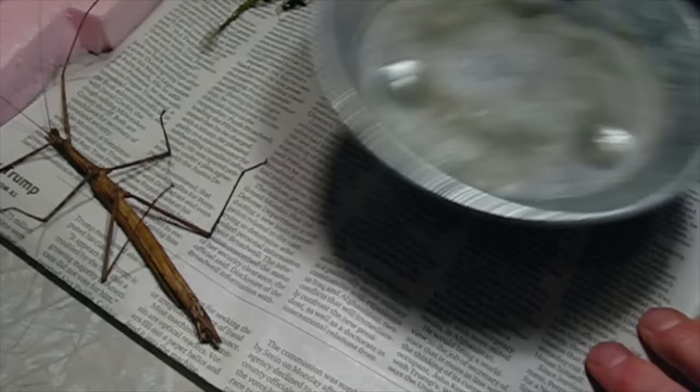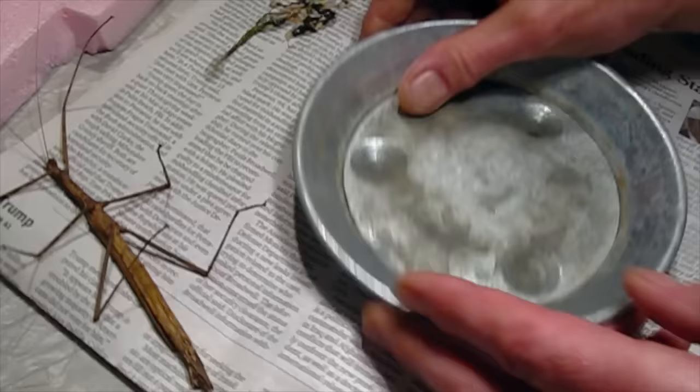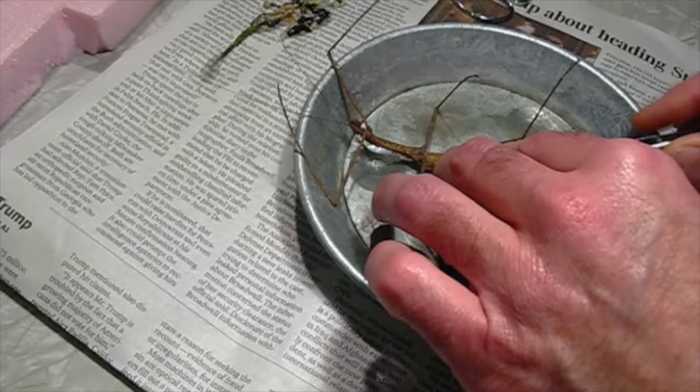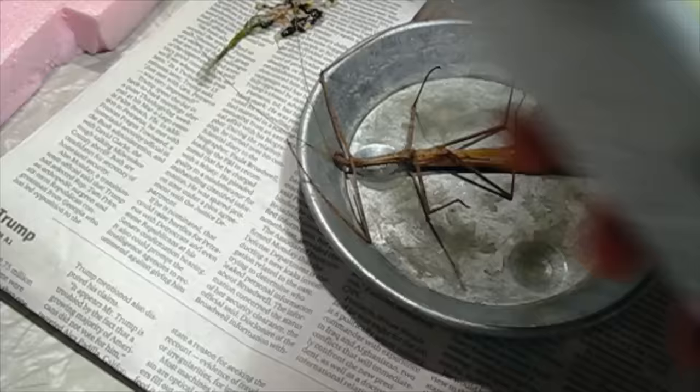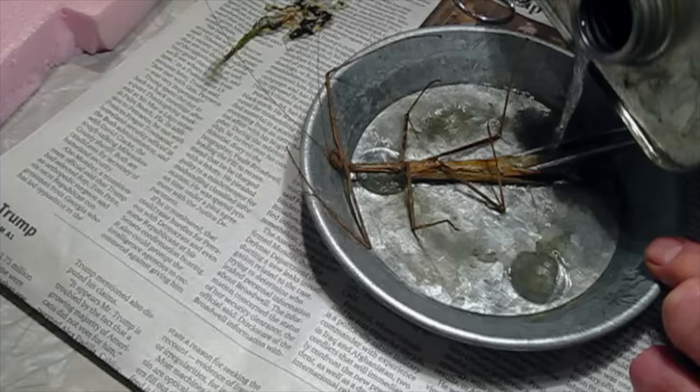This is a metal saucer that goes underneath a potted plant, and I'm going to use this to hold the acetone. I'll put the insect in here and use my tweezers to hold the hole open a little bit. Then I've got some acetone — again, this is flammable and toxic, so you don't want to breathe the fumes and you want to keep it away from flames. I'm going to pour a little bit right into the open body, and then set this outside for a little while, maybe 20 to 30 minutes.